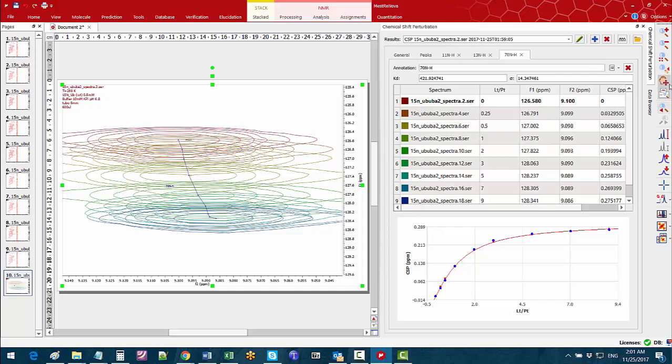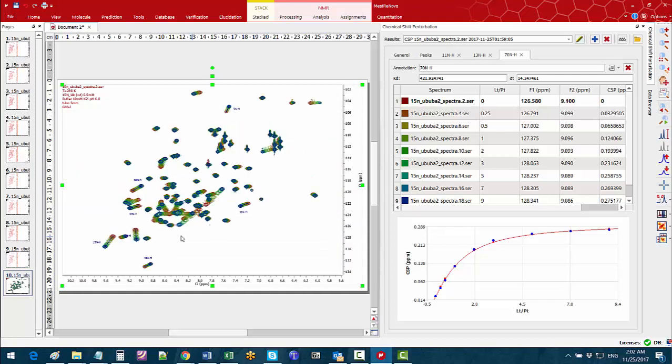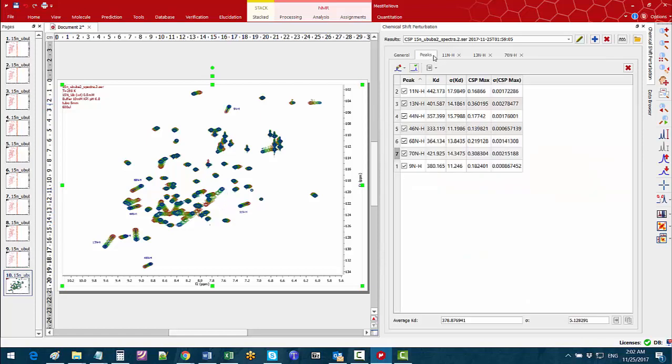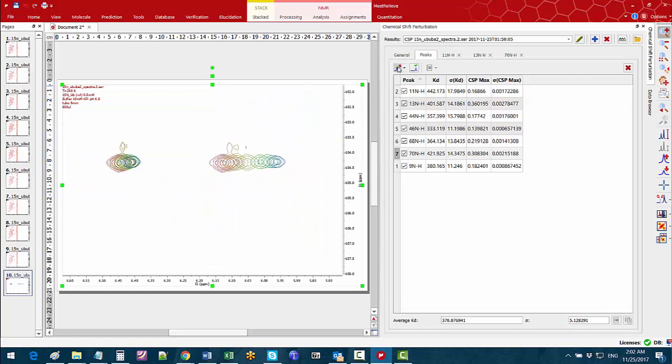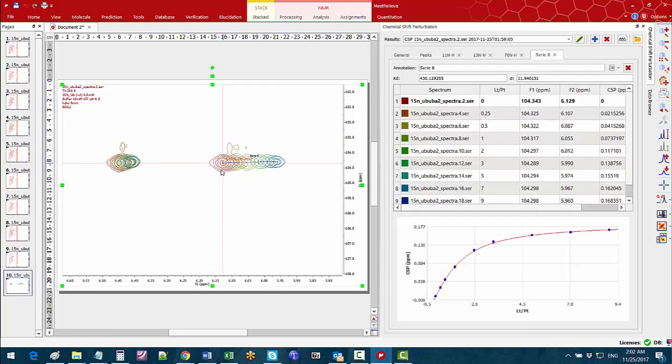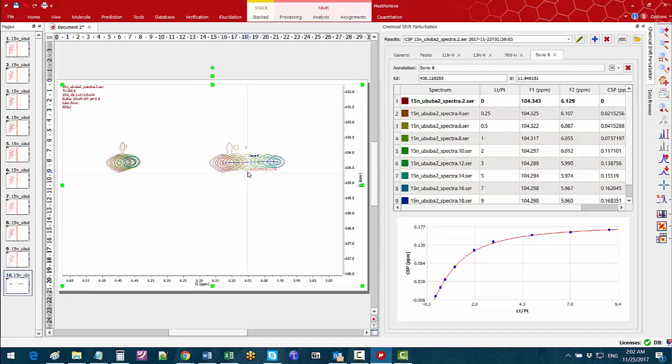Zooming out we can go back to the fingerprint region. We may want to add more peaks to measure their KDs. For this we can manually pick those peaks. Zoom in and if for instance we are interested in this red peak, select the peak picking tool and click on the actual peak. MNOVA will follow the peak changes and add the peak and its results to the chemical shift perturbation table.